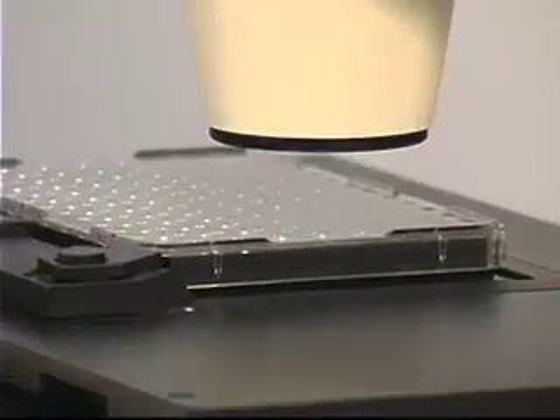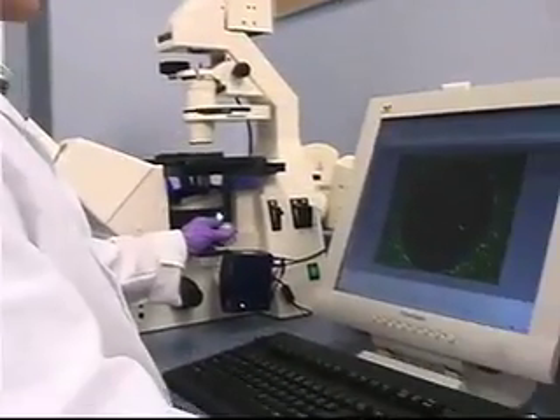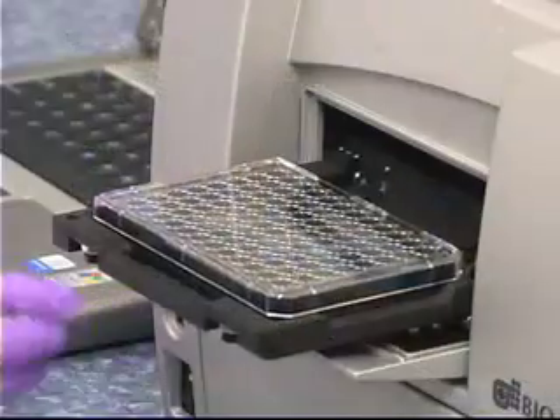Incubate the cells to allow migration to occur. Due to the flexibility of the Oris assay design, migration can be detected via microscopic analysis, digital imaging, or with a fluorescent plate reader.